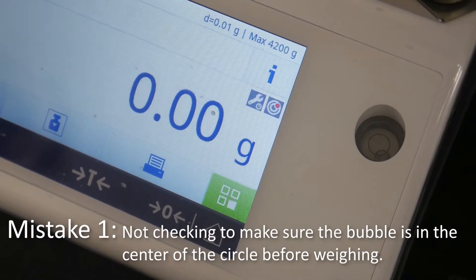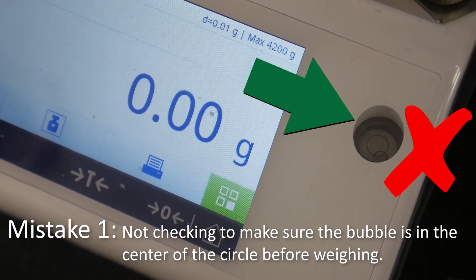Mistake 1: Not checking to make sure the bubble is in the center of the circle before weighing.